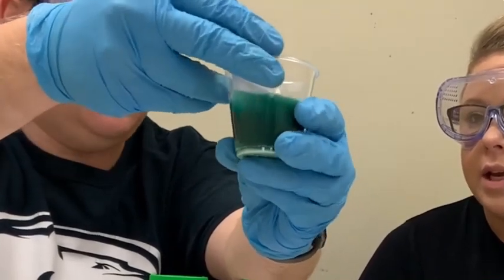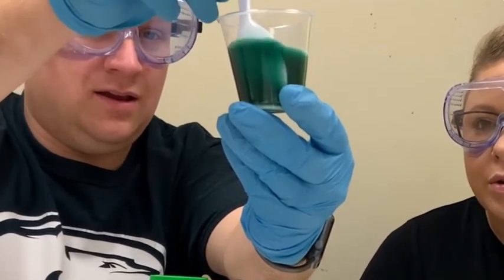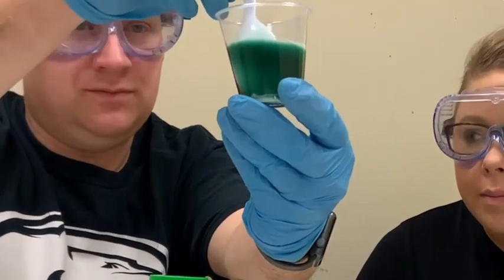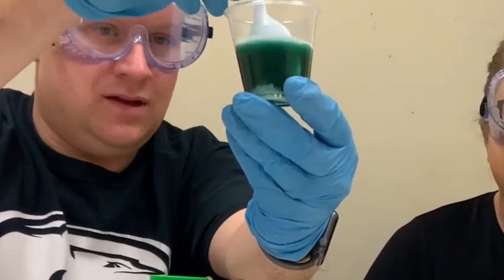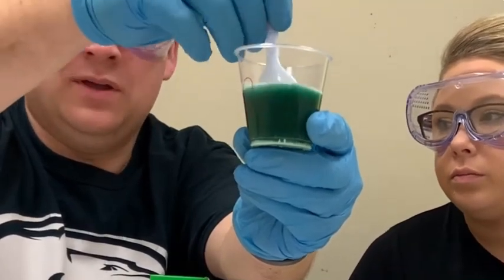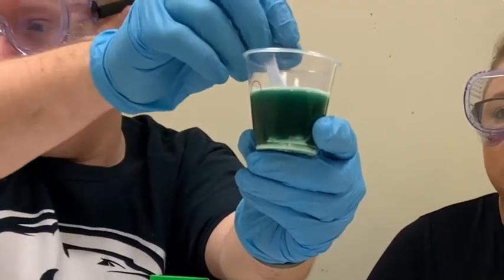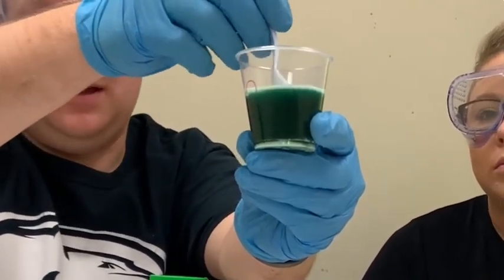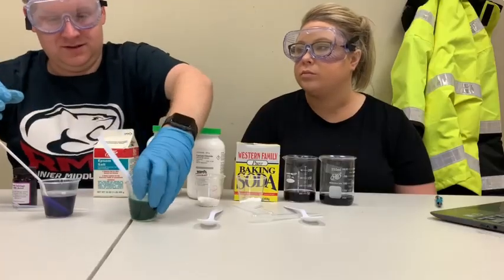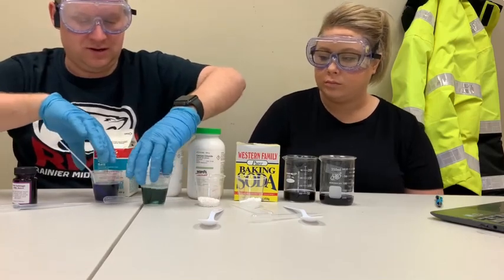It's definitely getting warmer. I don't see any gas being produced. There's no bubbles. And it's not forming a precipitate, which would mean that it was forming some solid material in there. Normally that goes to the bottom, but our solid material here at the bottom is still the sodium carbonate. Yeah, that one really got warm. That was a cool one. Put those back here, so I'm trying not to knock into them.